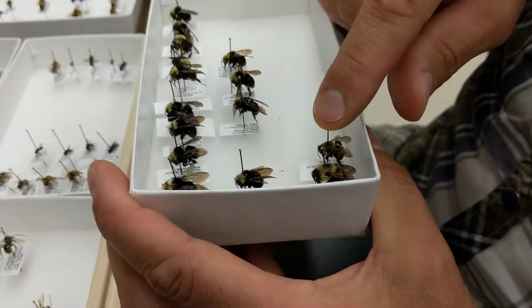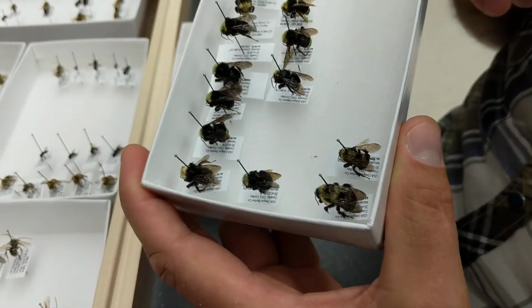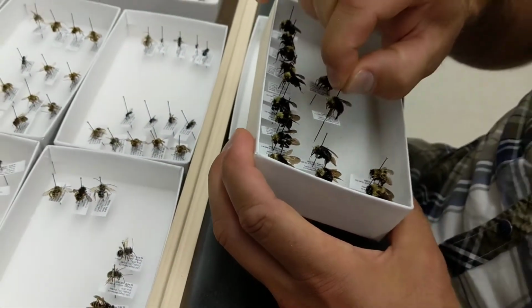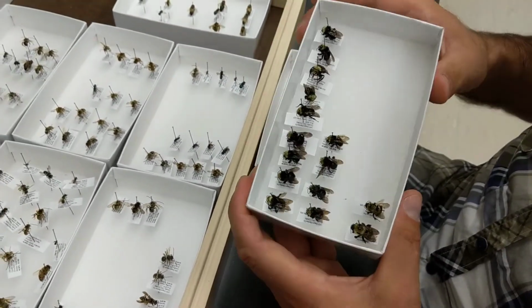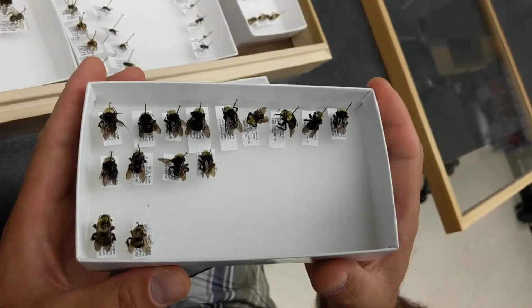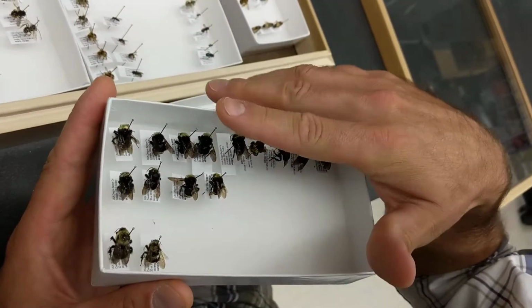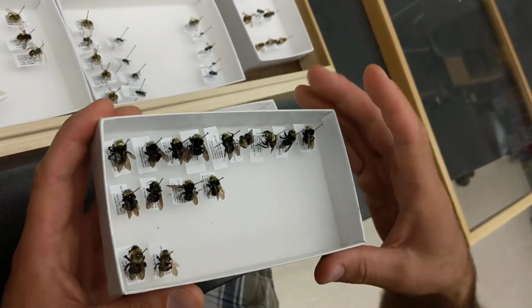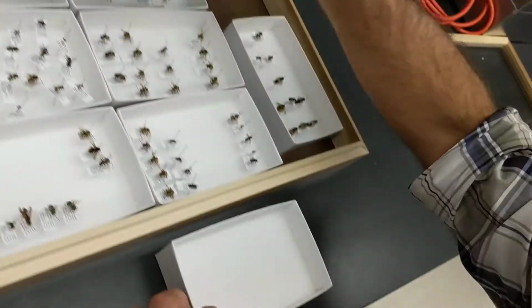And then also the first two segments of the abdomen have some colored hairs, whereas these ones don't. So there we go. Now we've got two species of bumblebees sorted to morphospecies. These ones are Bombus vosnesenskyii, and these are Bombus griseocollis, because I know the bumblebees.